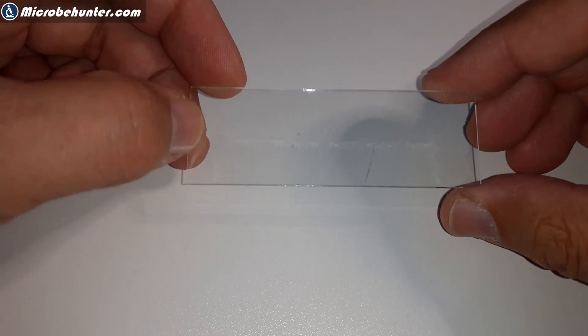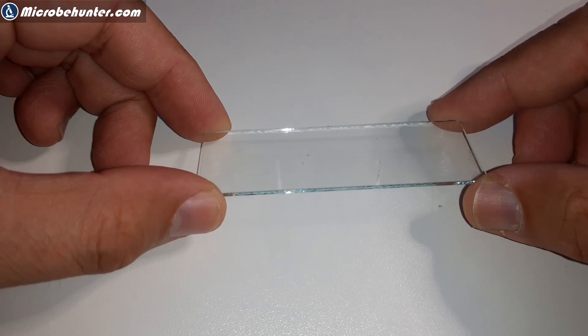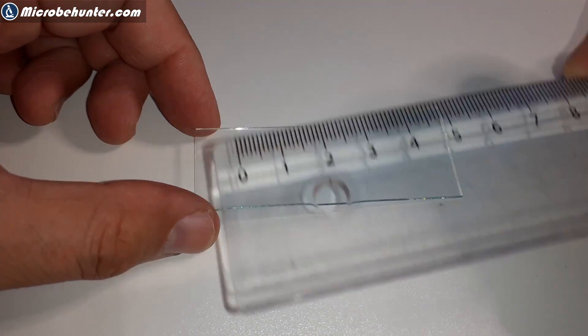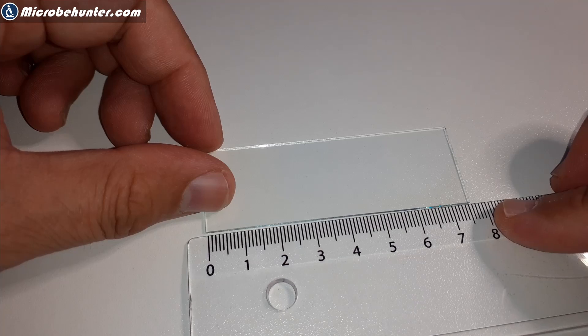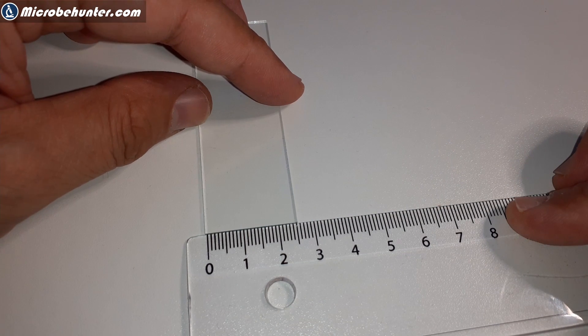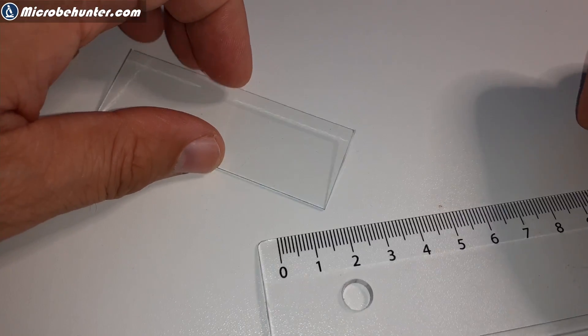This here is a standard microscope slide, actually one of the cheaper slides I'm using. I'm going to show you some higher quality slides as well. The size of a microscope slide is approximately 75 millimeters, which is three inches, by about 25 millimeters, which is one inch. Pretty much all microscope slides have this size.